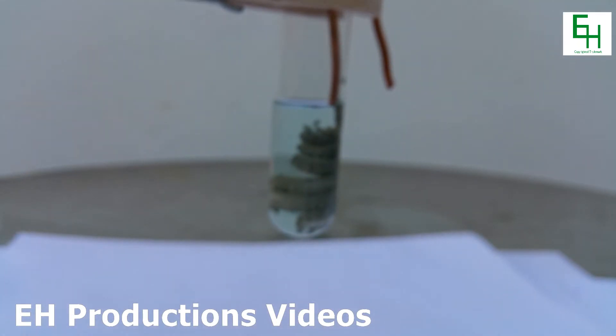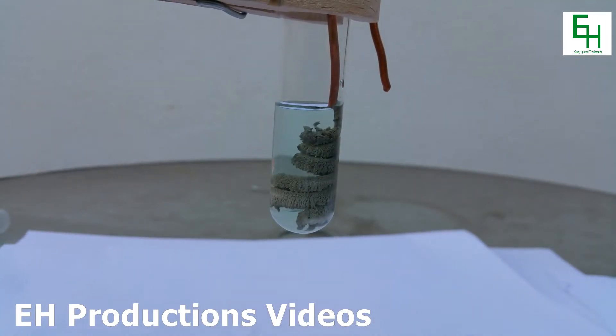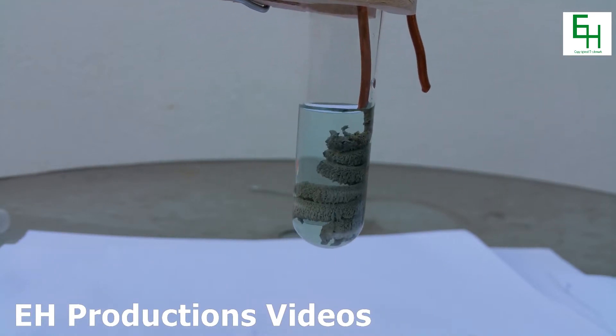Being extra careful not to touch any of the silver nitrate solution, because it does stain your skin. Alrighty, let's take this out of the solution.